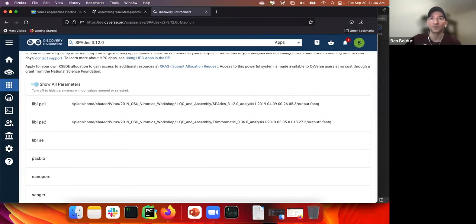So if you want to ensure that you're trimming off all of the sequencing adapters and primers, then that's what I would do first. So get your data, clean it up using Trimmomatic or whatever other trimming tool you want, and then map out your host DNA, and then assemble.